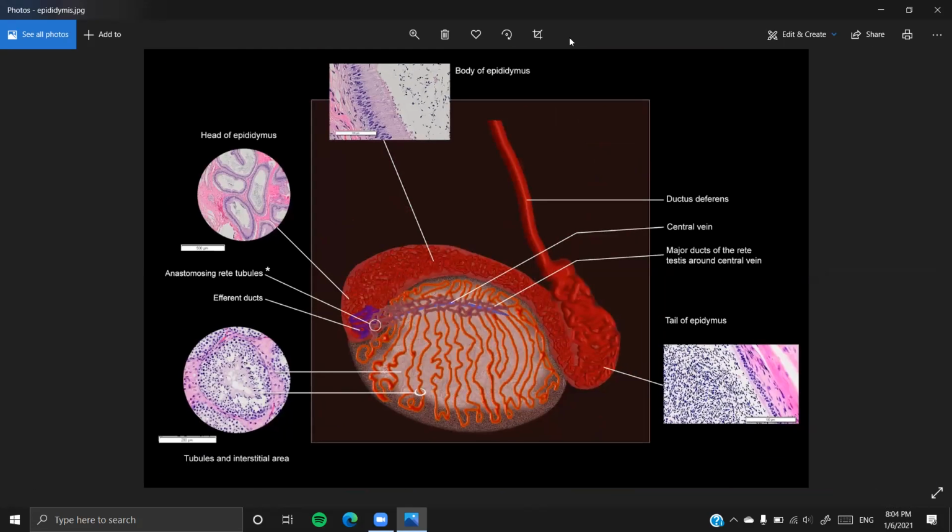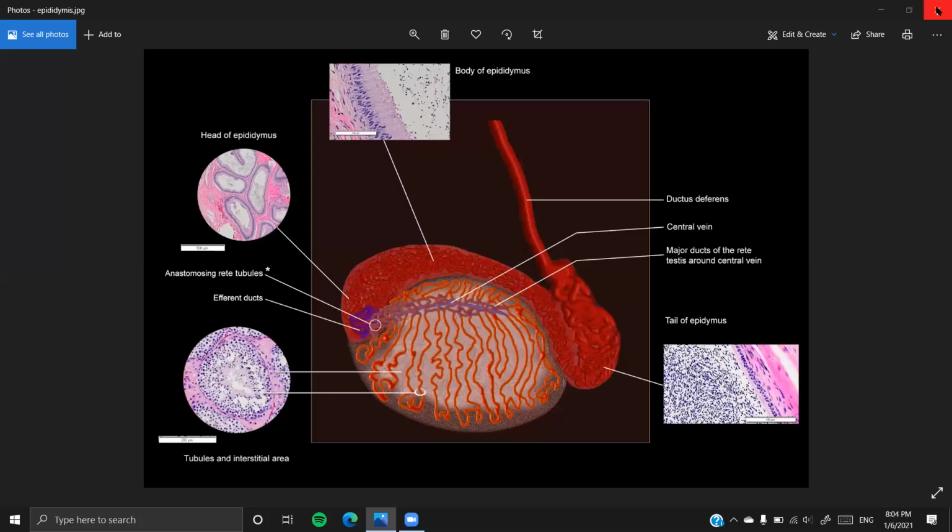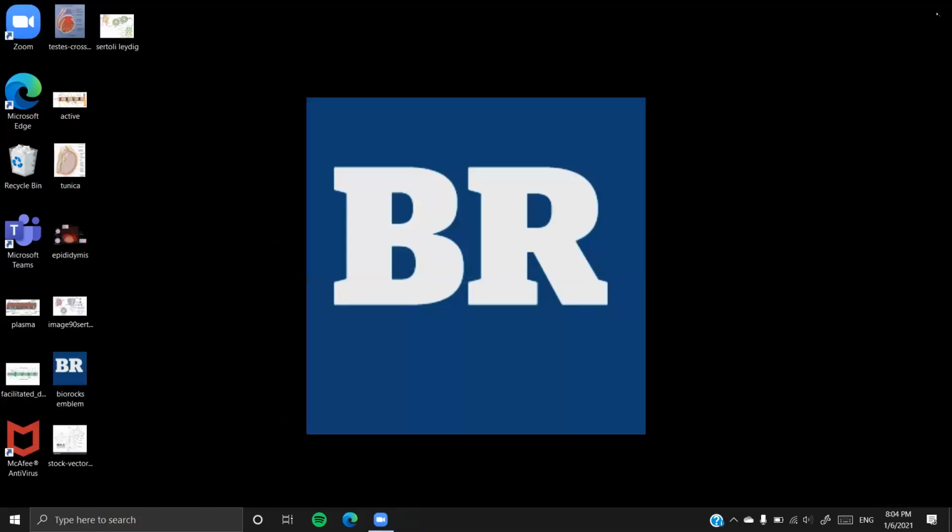So these are the things I wanted you to learn for the examination point of view. And now let me show you if I have some other slides which can help you in understanding. Yeah, so now coming on to this particular thing.